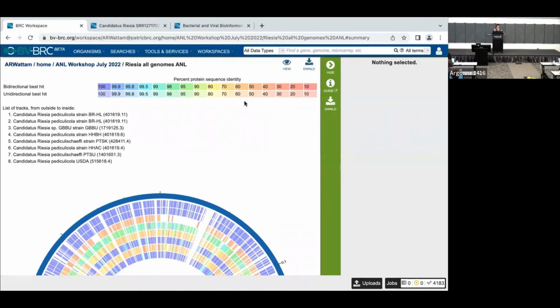Maybe to somebody, not particularly to me, because I'm not working on a publication here. The main reason for me to choose these was I wanted to show you the visualization that's possible for these. And I had to choose something that some of them have, or it would look dumb. So I wanted it not to look dumb for you.